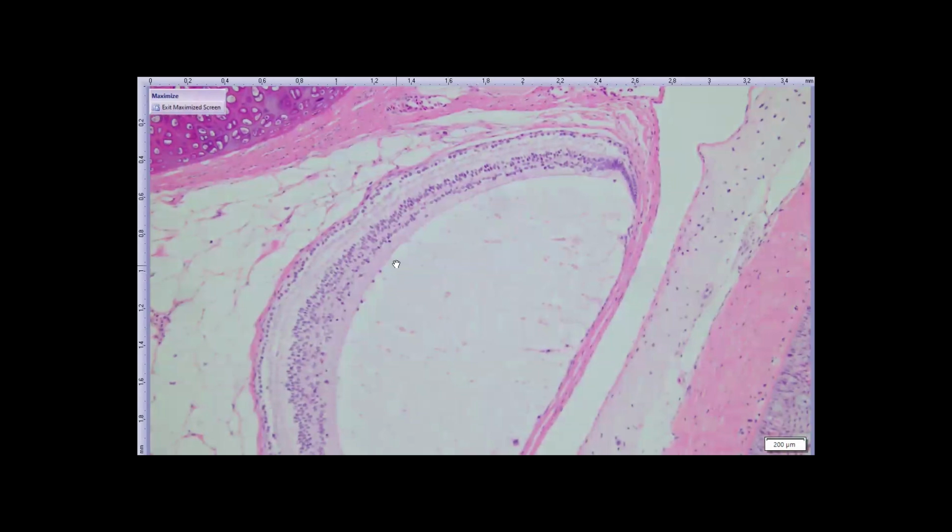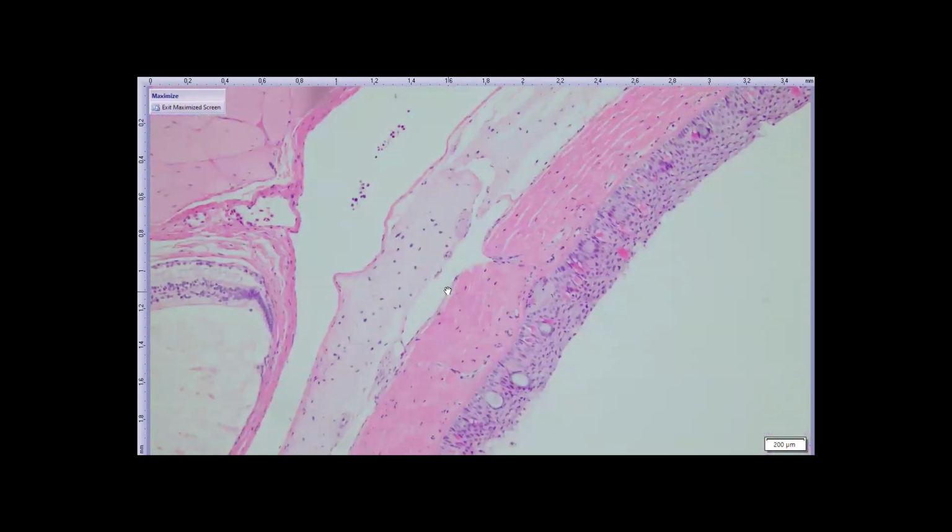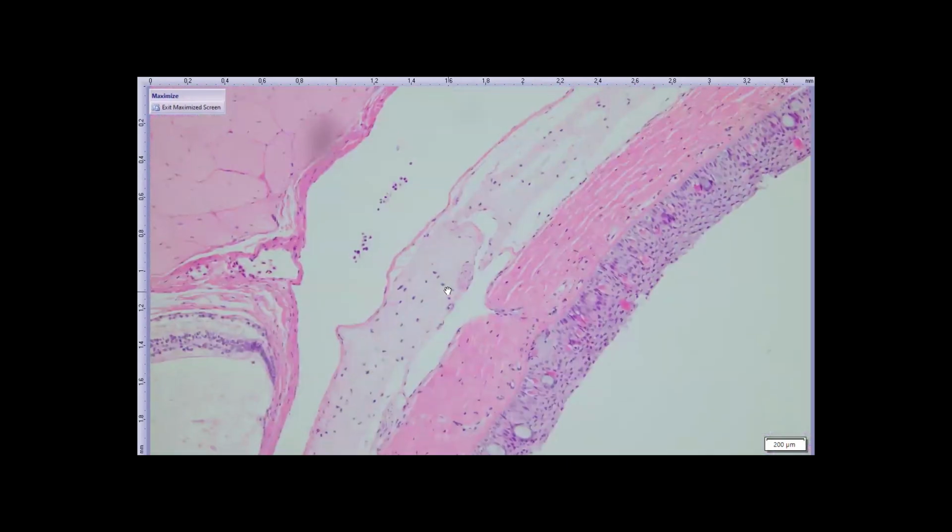Most vertebrate eyes have an outer nuclear layer, an inner nuclear layer, and a ganglion cell layer. This one has only 2 layers, and I don't know enough about hagfish vision to know the names of the layers. Then there's a retinal pigment epithelium. There's an optic nerve, but this section doesn't sample the optic nerve, and there's no lens. There's no pigment. It's not an eye that can accomplish vision because it's buried underneath the skin.